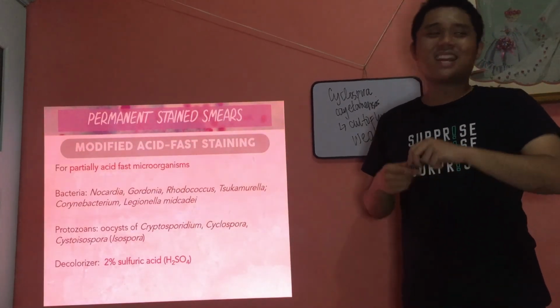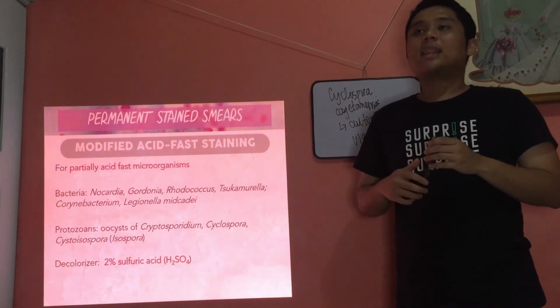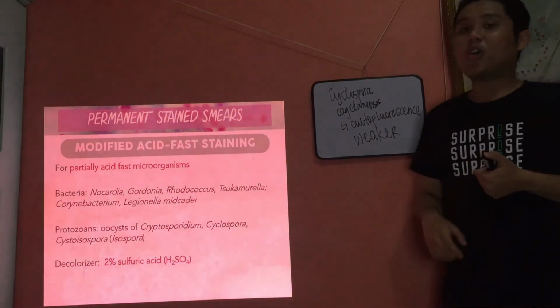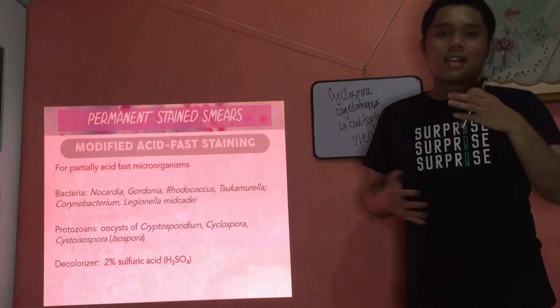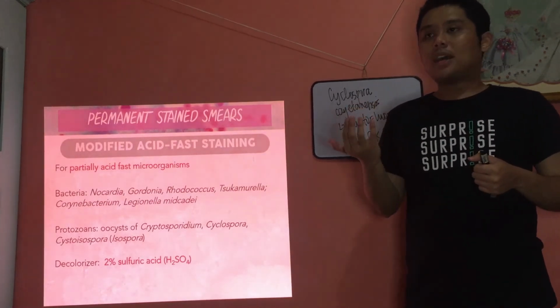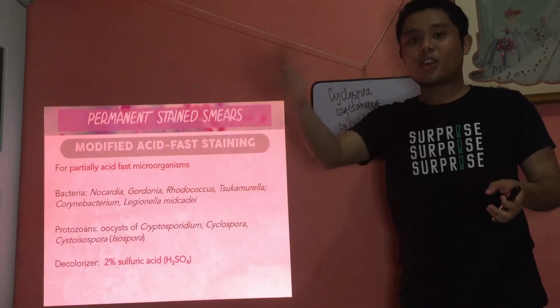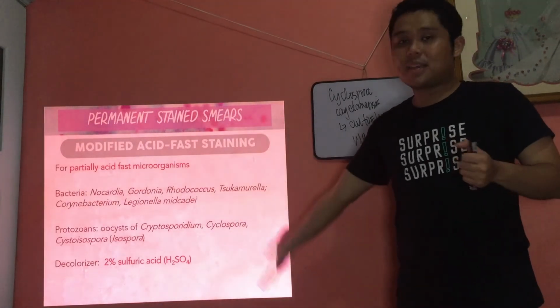Lumabas din sa boards. What is the difference between the modified acid-fast and the true acid-fast stain? The modified acid-fast uses a weaker decolorizer. Okay? Because again, as mentioned, small content of long-chain fatty acids for these organisms. So you don't use a strong decolorizer. Kaya ma-over-decolorization na, so therefore, it can lead to false negative results. We cannot see them anymore.